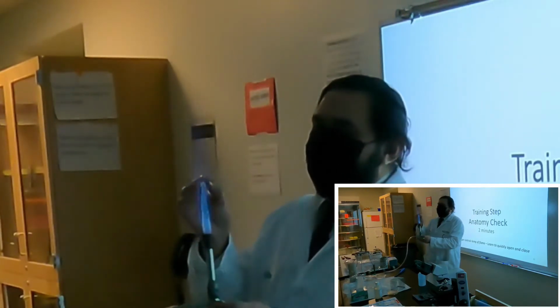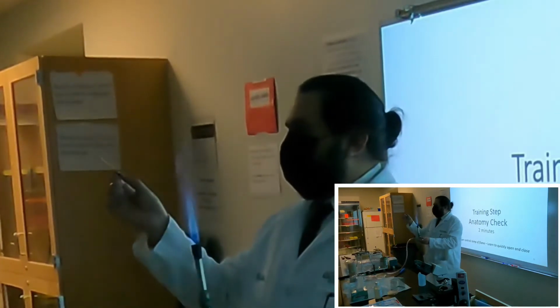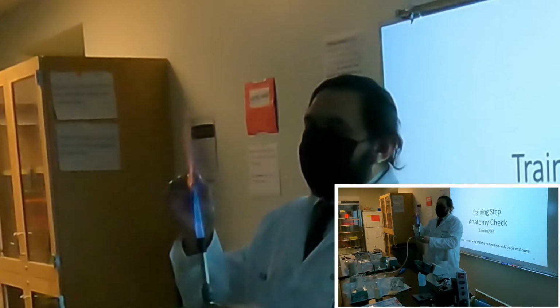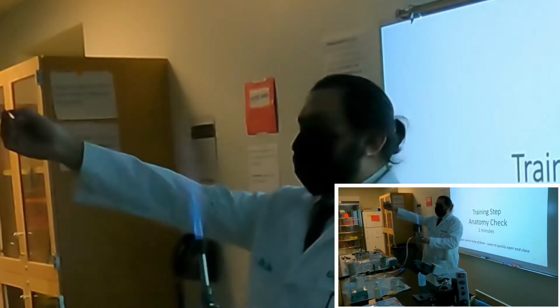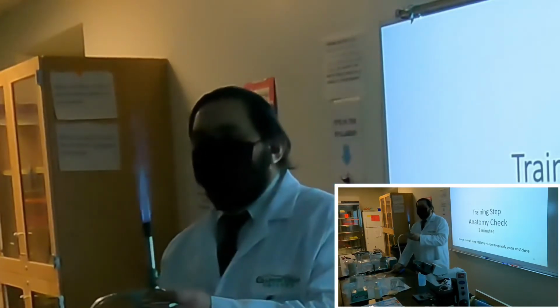Instantaneously. You can see even the color of the metal. If I leave it there, it will melt all of this off. Okay, so it's designed so you pass it through the tip of the inner cone, right? A couple of times, and this is nice and sterile now. So that's the level we want to achieve. So we're going to practice it in here.